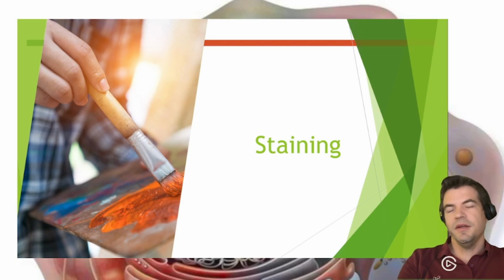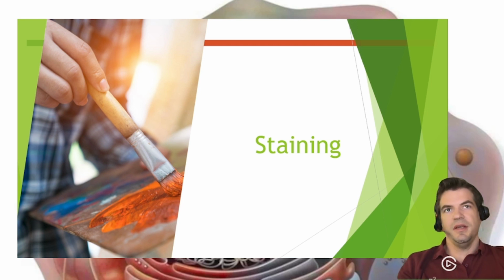Okay, welcome back to the Microscopy and Staining video series. This is the section on staining. Here we will describe the stains that we will actually use in the lab.